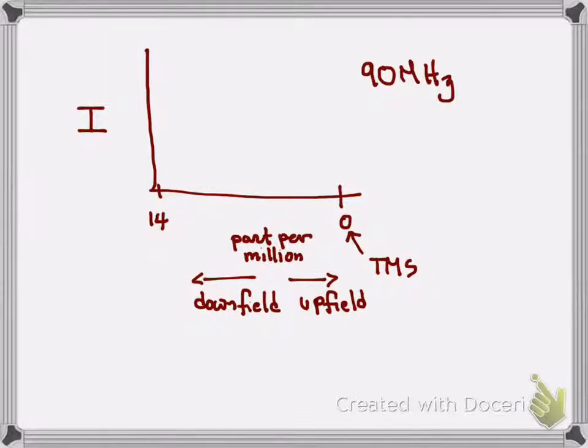If you wanted to know the actual frequencies of signals, let's say this is at 2 ppm. What does ppm, parts per million, mean?